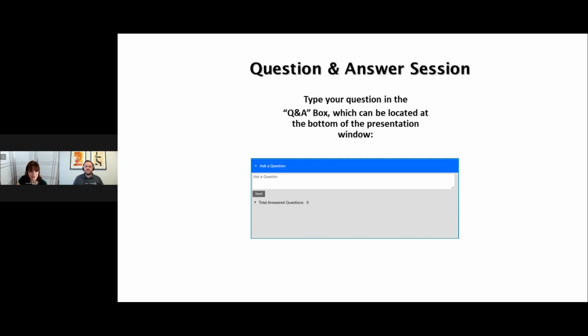Great, thank you. And are the library searches being conducted with in-house static libraries, or is it searching web-based data on the fly? Sure. So the MSMS spectral libraries, those are in-house static libraries. You can also pull in libraries from other sources as well. As far as matching with Compound Crawler, where we're searching for the molecular formula, that is done live with an online database. So as those databases update, that is a live web-based search.